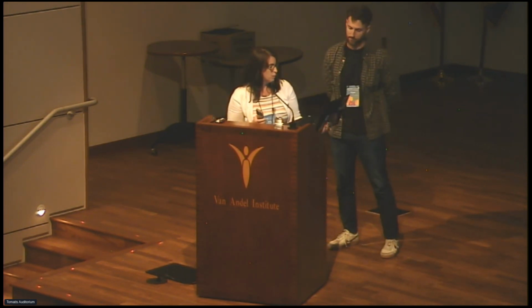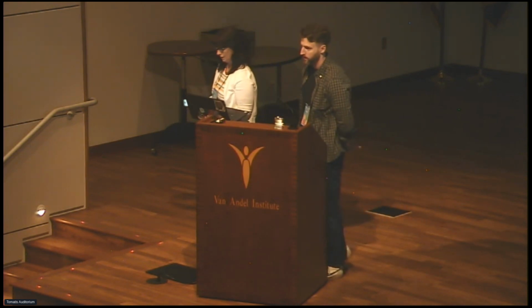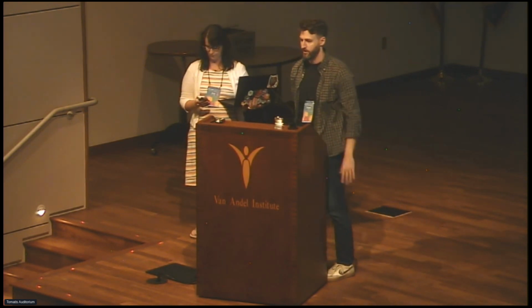Hopefully it's quick. Will this work for Visium HD? So we have not tested that yet, mainly because getting Visium HD into the SPE objects, which this is based on, has not been perfected yet. There's nothing that should hold it back. So that's something I'm definitely wanting to look at.